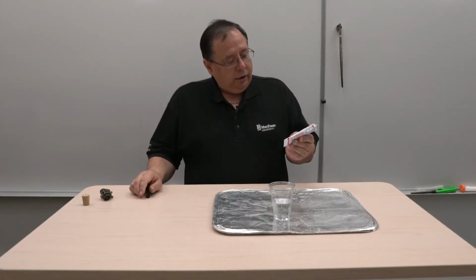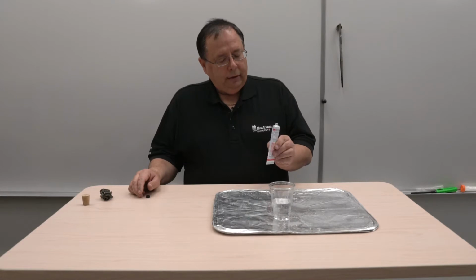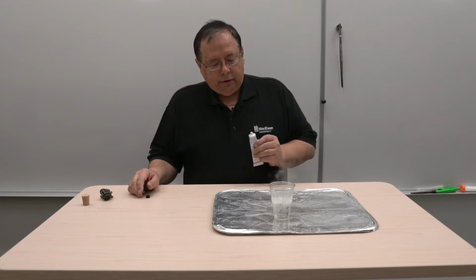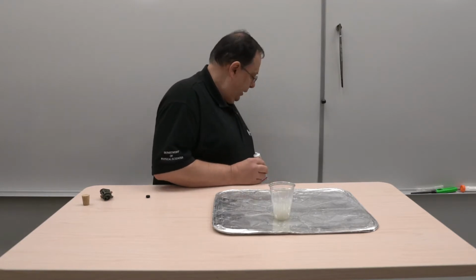What we are going to look at next is a chemical called calcium carbide. And calcium carbide is a grayish solid. And the nice thing about this is it does a reaction with water. Let's have a look. If I add it to the water, you can see it starts to bubble and form gases. It gives a little bit of a precipitate in that case there.